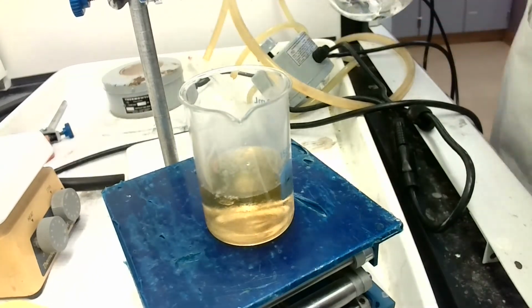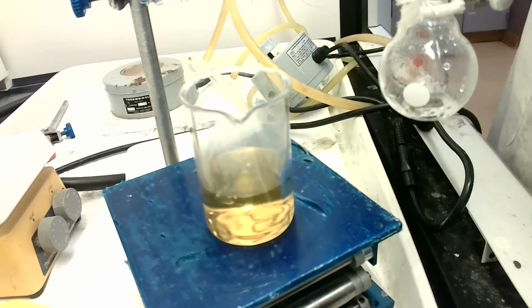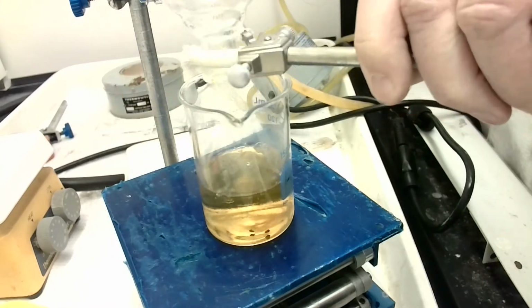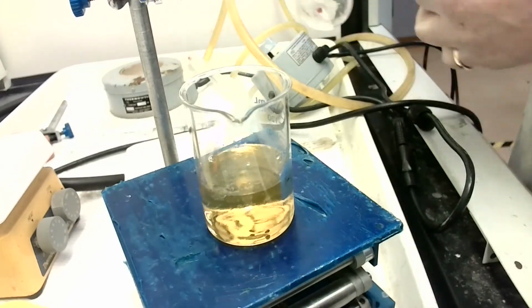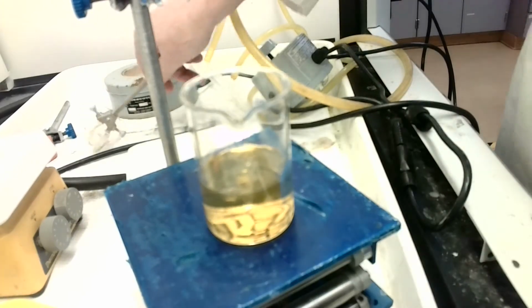And I'm going to do a rinse with boiling hot water. It looked almost like a precipitate was forming, then it all dissolved again. We'll ice bath it next. Okay, so it looks like we've more or less rinsed everything out of our round bottom.